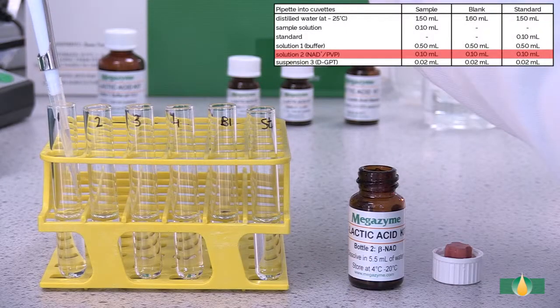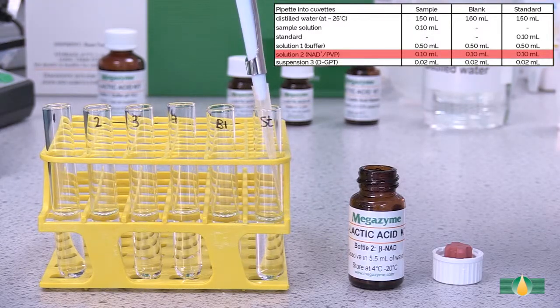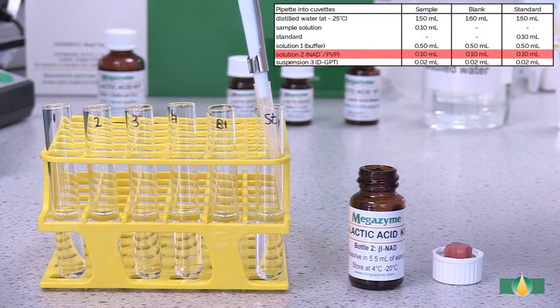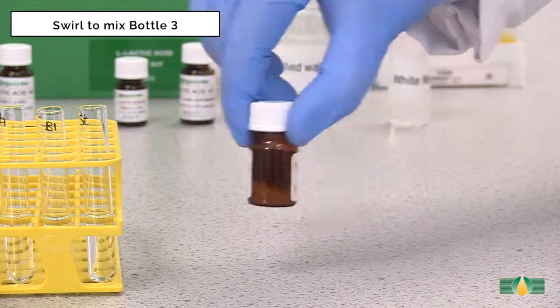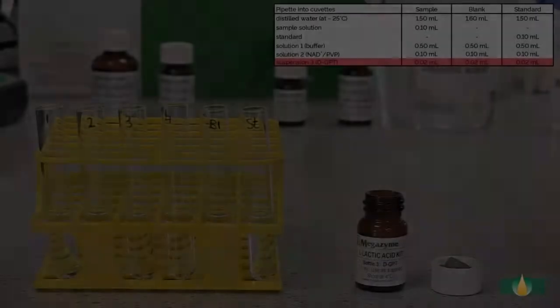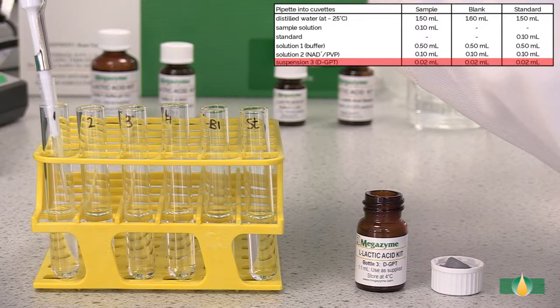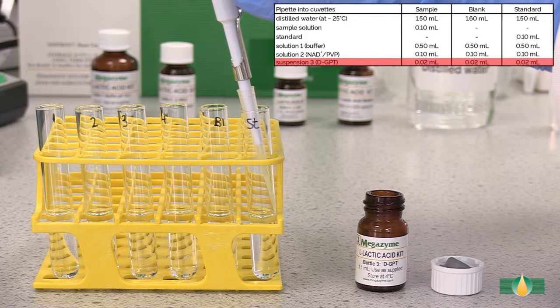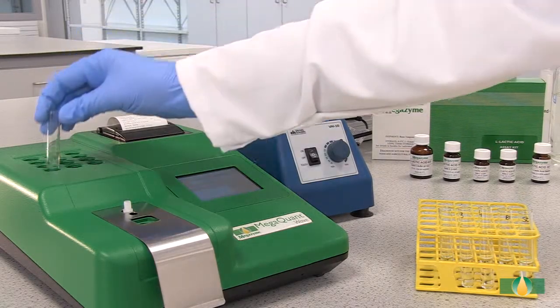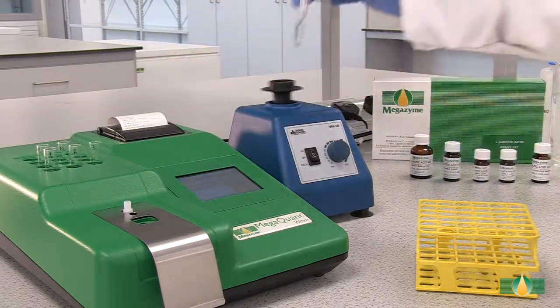Pipette 0.5 milliliters of solution 2 into all assay tubes. Swirl to mix the contents of bottle 3 prior to dispensing. Pipette 20 µL of suspension 3 into all assay tubes. When all of the components have been added, mix the tube contents thoroughly and incubate the tubes in the 37°C heating block for approximately 3 minutes.